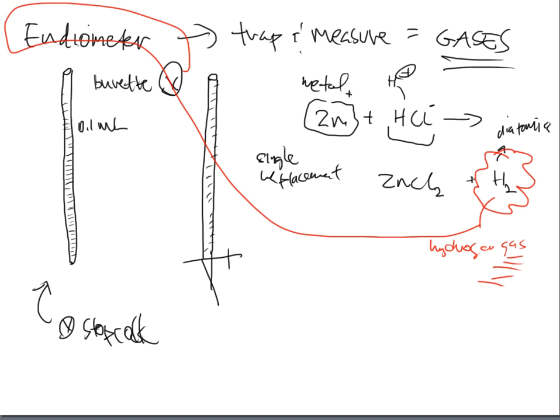All right, so let me draw you a schematic of what's going to happen here. What will go on in the lab when I do this lab is that I am going to take my eudiometer and turn it upside down. The opening of the eudiometer will be down here at the very bottom. My tick marks are still going to be there, not a big issue at all.